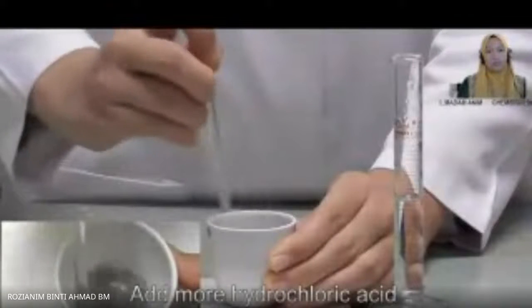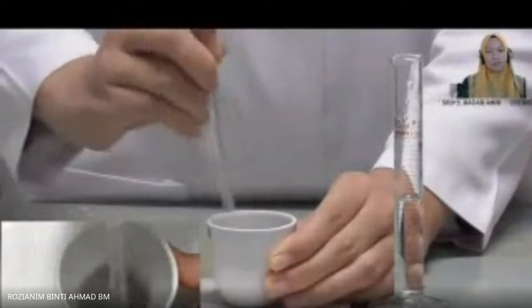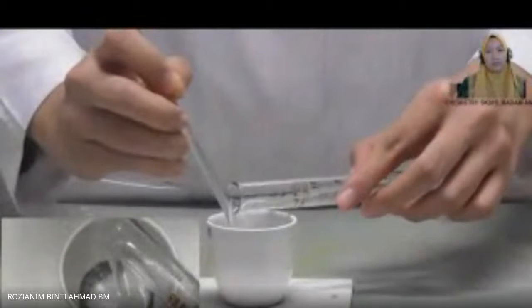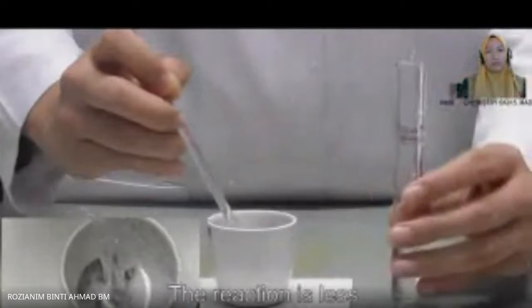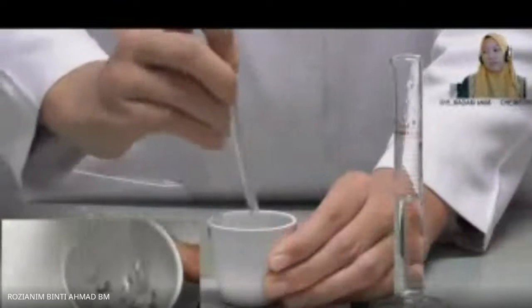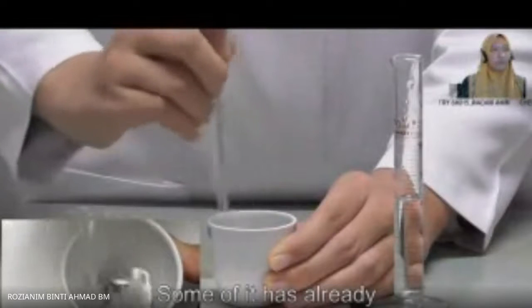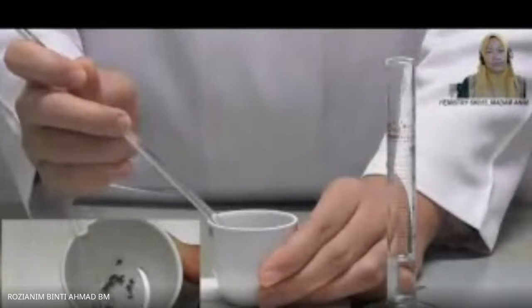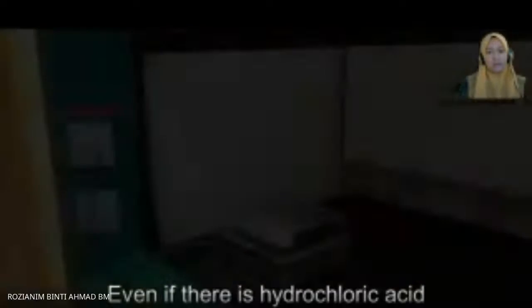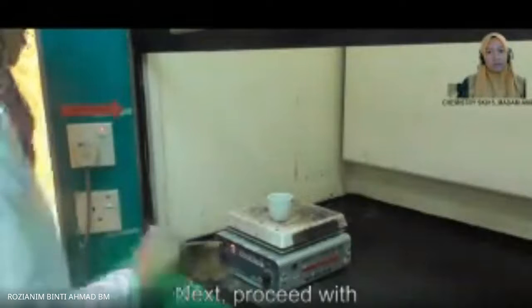Add more hydrochloric acid and keep stirring until all zinc has dissolved. The reaction is less vigorous than before because less zinc is left in the mixture. Some of it has already changed to zinc chloride. Once all zinc has dissolved, stop adding hydrochloric acid even if there is hydrochloric acid left in the measuring cylinder. Next, proceed with the heating process.